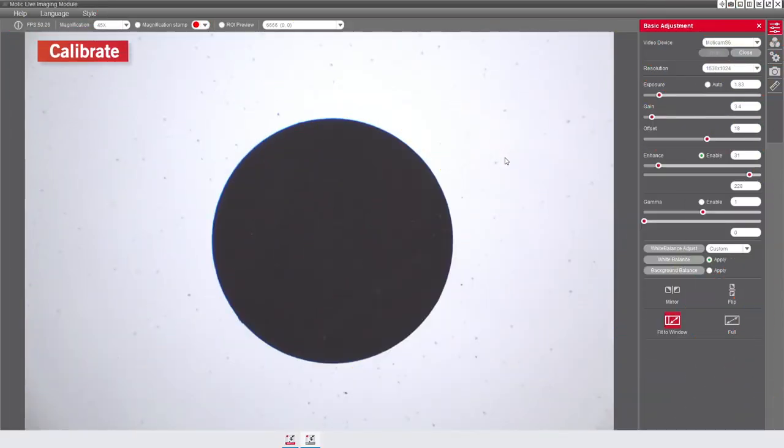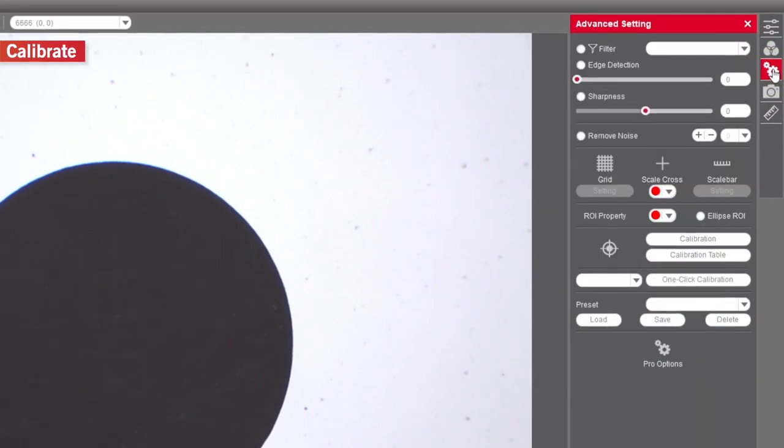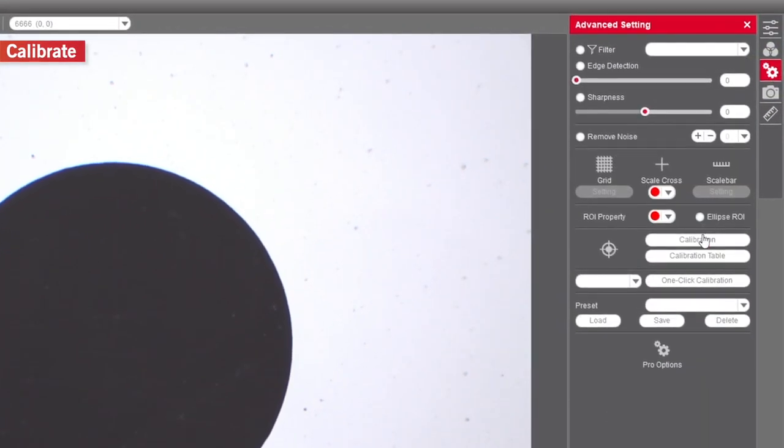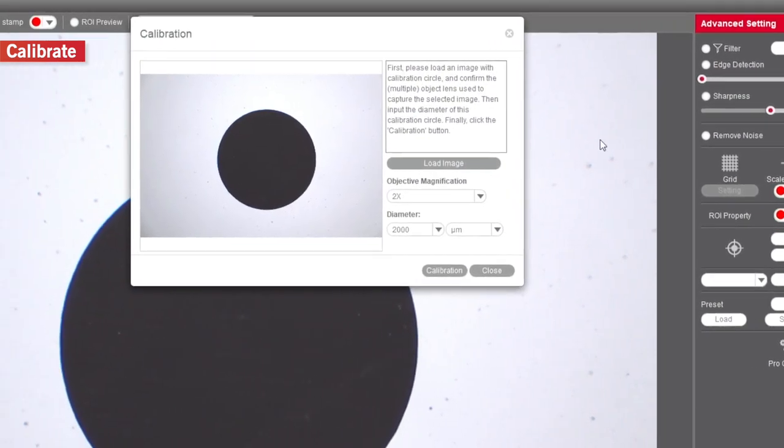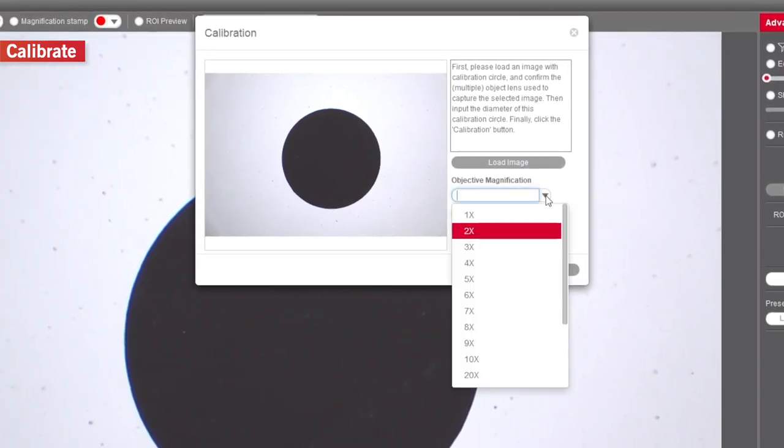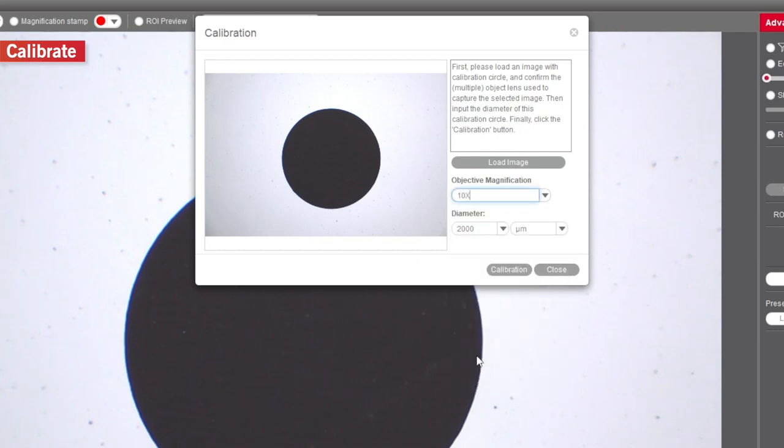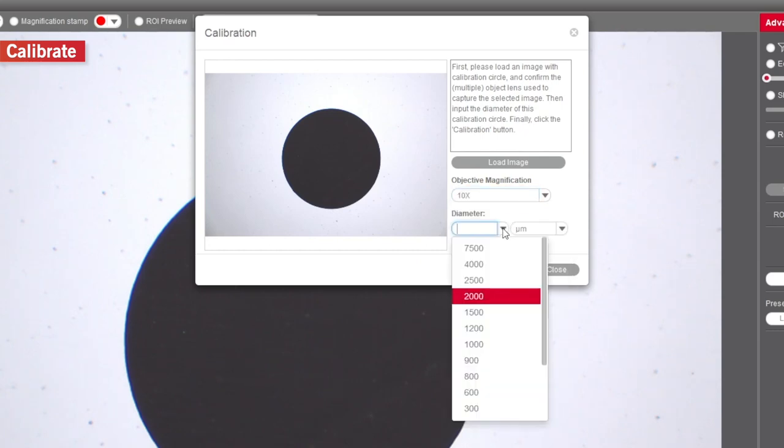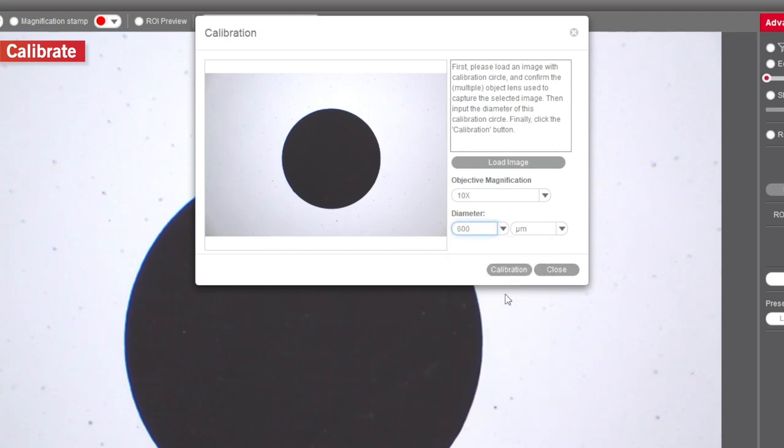Go to Advanced Settings and click on Calibration tab. Select Objective on the drop-down menu Objective Magnification tab. Afterwards, select the diameter on the drop-down menu Diameter tab. Now, press the Calibration tab.